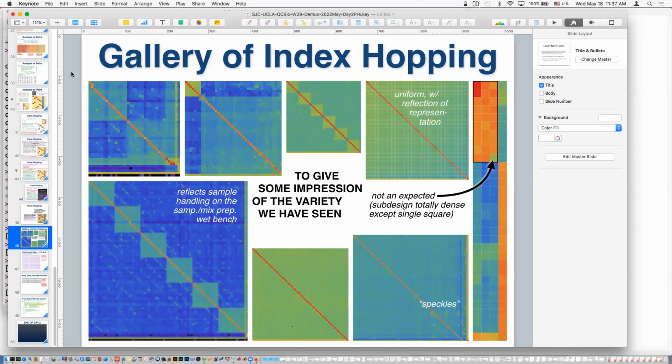Here I took the extra step to actually make black. The 0 would be black. 1 then starts, I think, at purple, and then it goes to blue, and then green, yellow, orange, and red. And that progression is a log scale. So this diagonal, that's the expected group.